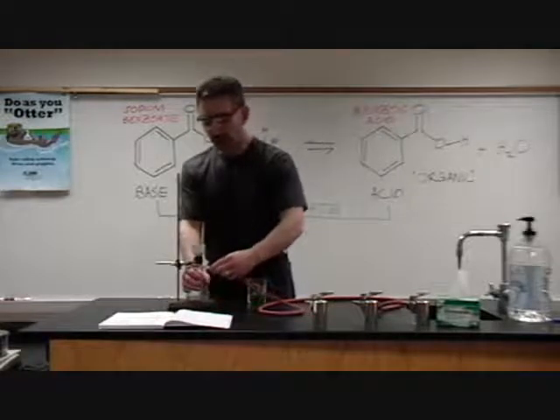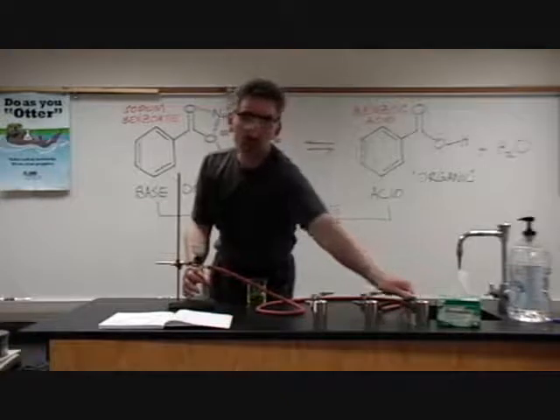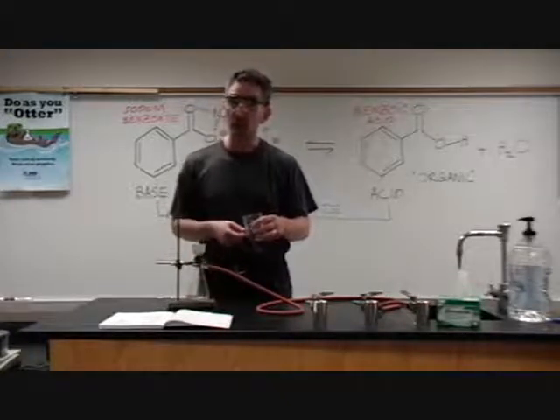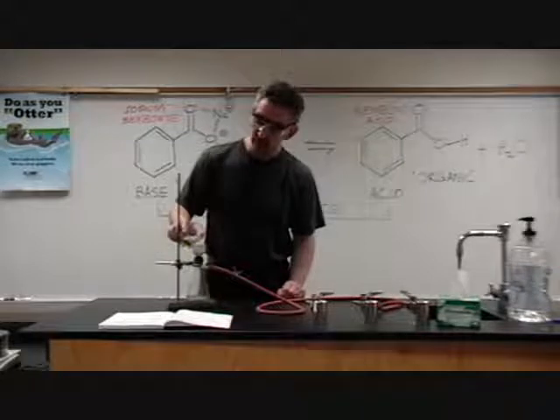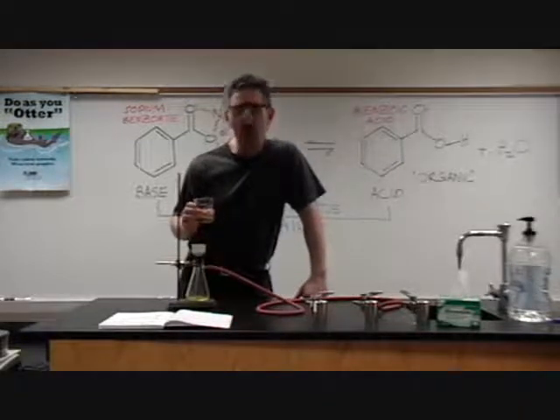Set up your filtration again, switch on the vacuum once more, and then using some of that liquid which is filtered through, use it to stir around and gather up the last of the solid precipitate. So you're not increasing the volume of the solution any.